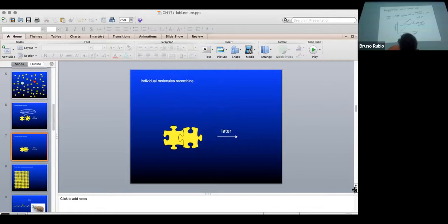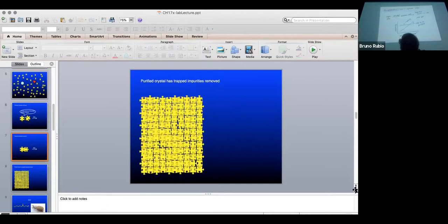And so here these two molecules are bumping into each other slowly, and pretty soon they figure out how to fit. If you were to take the solution and just plunge it into an ice bath, this wouldn't happen. You wouldn't get recrystallization to be effective at all. And then two molecules have fit together, and pretty soon everything fits together. And so this is how the recrystallization works.